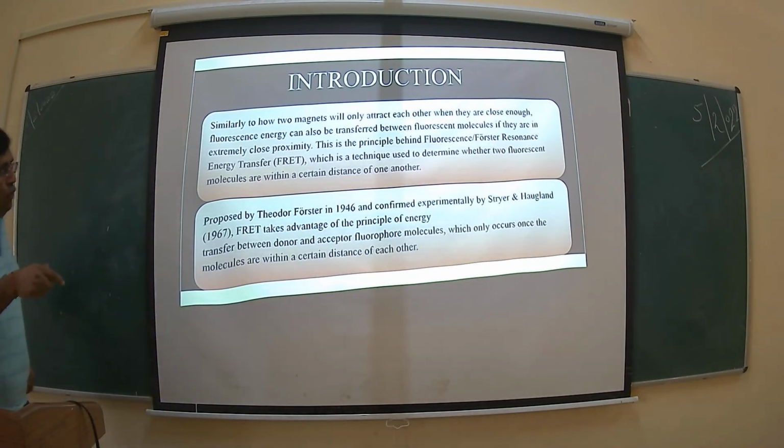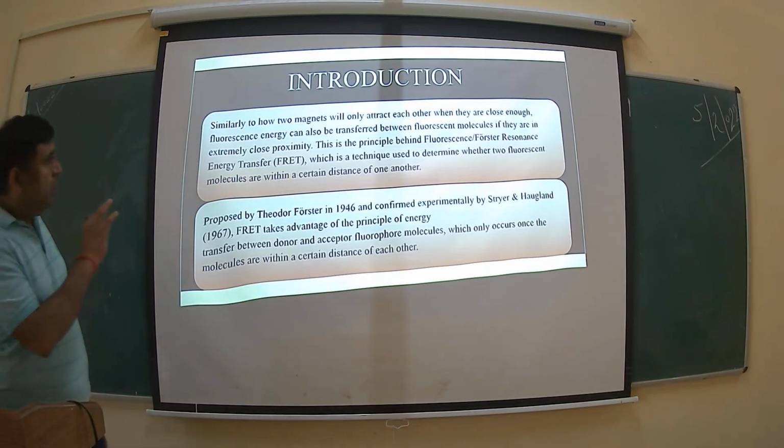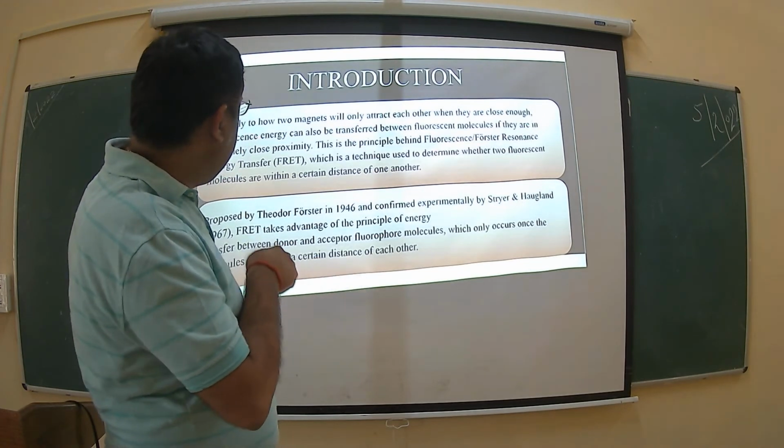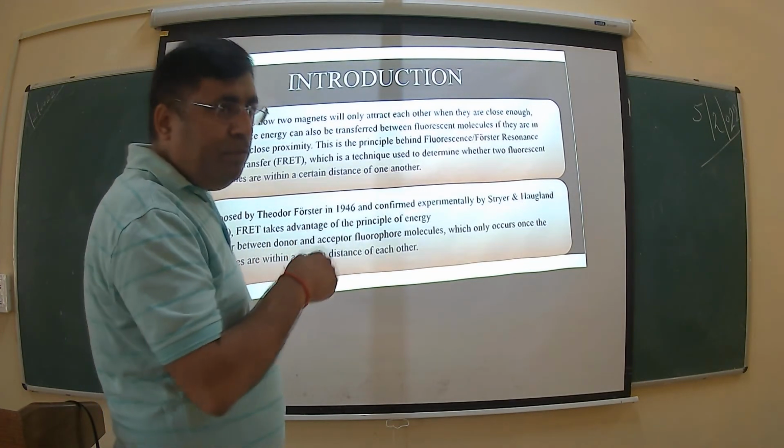If you understand resonance energy transfer, the resonance energy will cause the fluorescence. If you want to understand this FRET phenomenon, you should understand it in this way: resonance energy transfer is causing the fluorescence phenomenon.